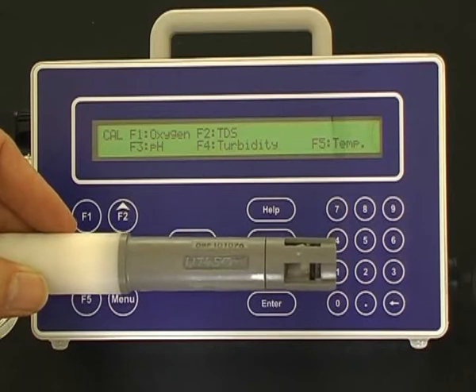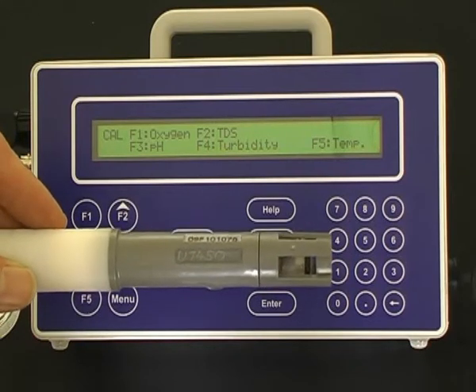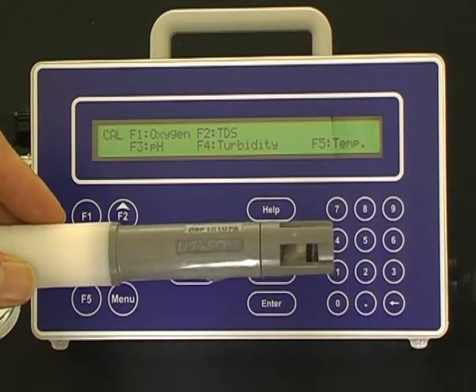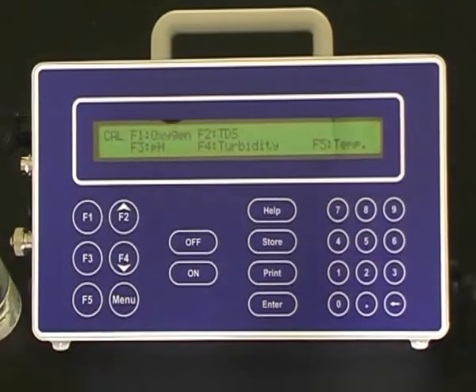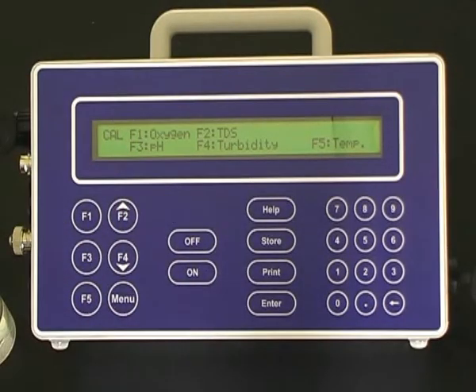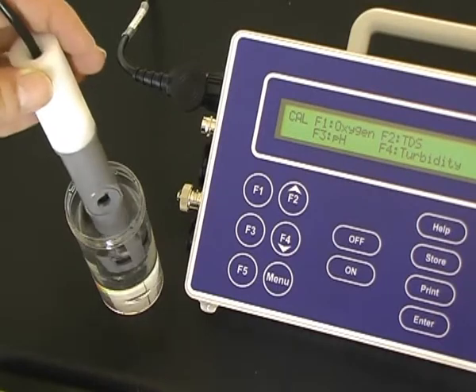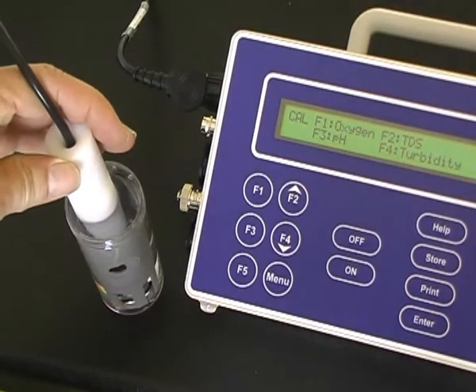The first point for the dissolved oxygen calibration is a zero calibration using the sodium sulfite solution we just prepared. Place the dissolved oxygen sensor in the sodium sulfite solution and allow it to equilibrate.